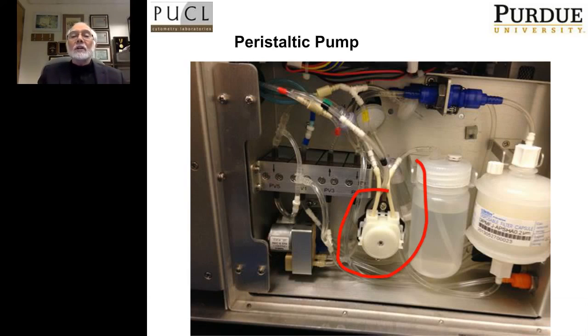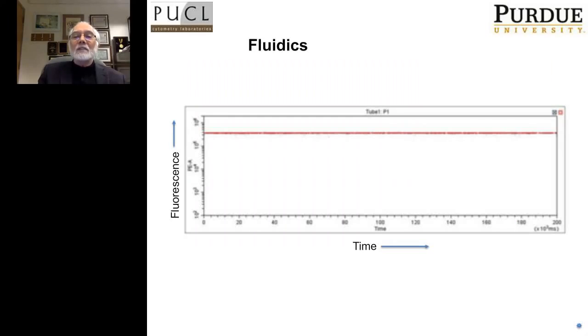I've put a circle around this device in the middle. This is a peristaltic pump, and this is the way that the sheath fluid is manipulated.